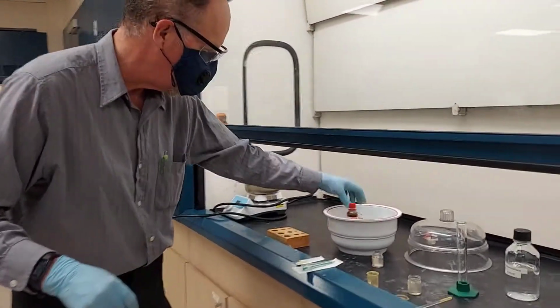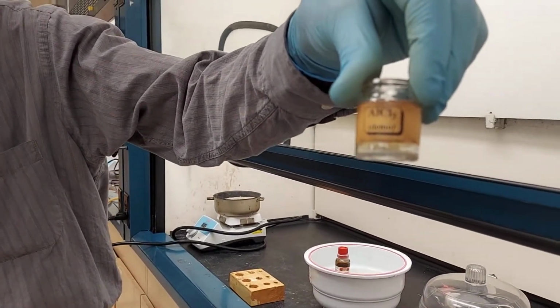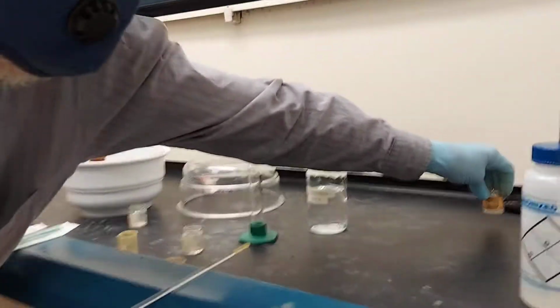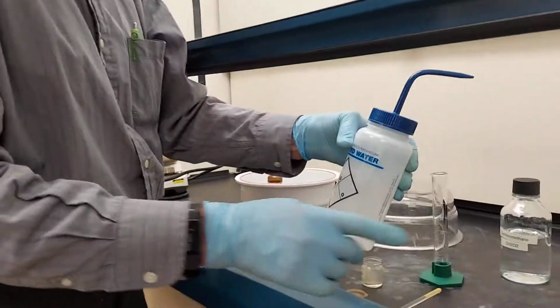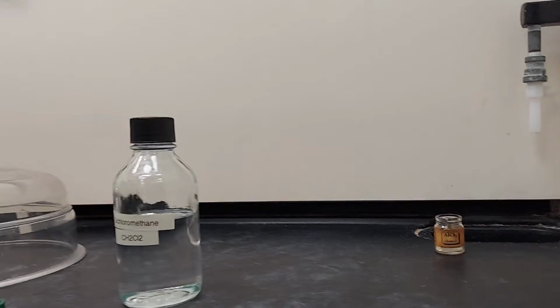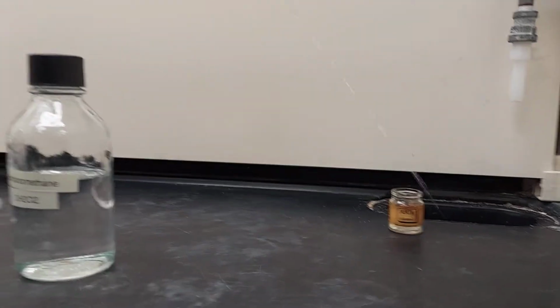Aluminum chloride was that powder I put in the flask recently. We have aluminum chloride for a demo here. And I'm going to put that at the back of the hood. And you carefully try to watch the flask. I'm going to put water in it. And I got it in the hood for a reason. You will see why very soon.